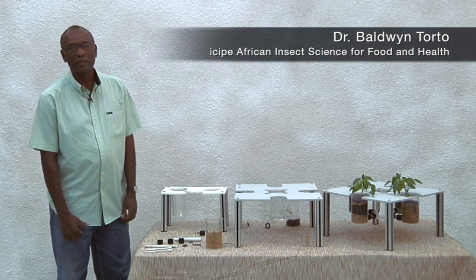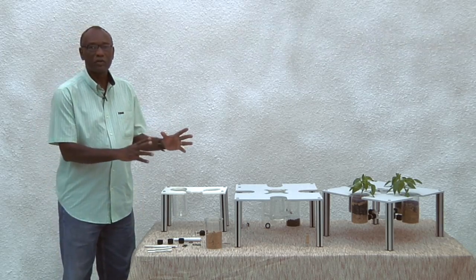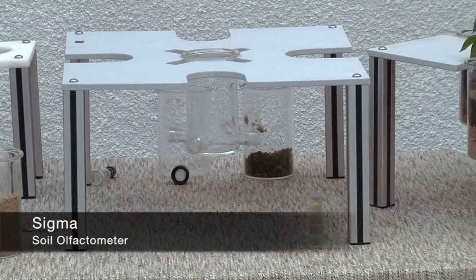I'm Dr. Torto from the International Center of Insect Physiology and Ecology. I am going to describe to you the soil olfactometer. The soil olfactometer has three components.